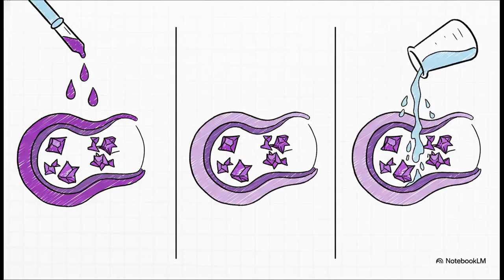So let's see how this plays out. First, we hit all the bacteria with the primary stain, crystal violet. At this point, everybody turns a deep violet color. Next, we add iodine. The iodine acts like a glue or a mordant, forming a big complex with the dye inside the cells. Now, for the game-changing step, the decolorizer.